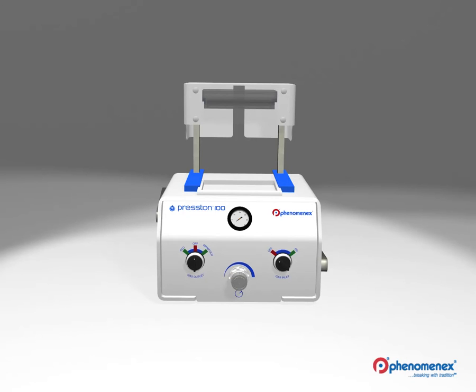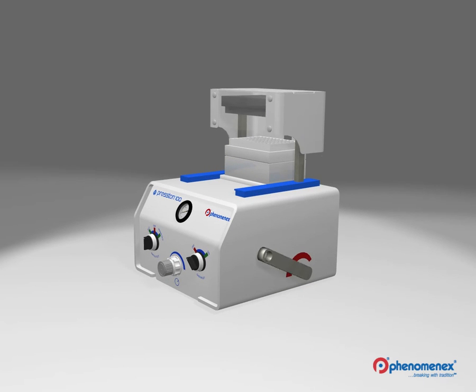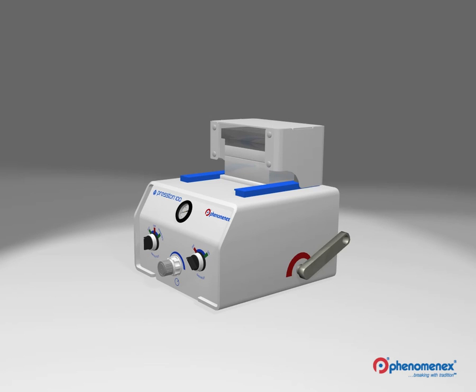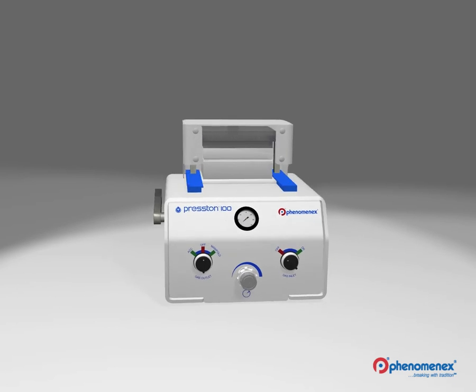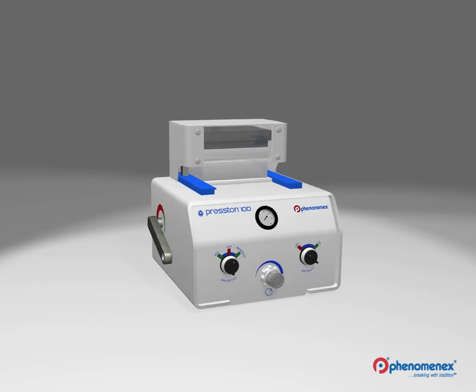To process samples using the Preston 100 Positive Pressure Manifold, simply load your collection plate or waste container into the sliding locator plate and then place your preloaded sample on top. The locator plate is then slid into position and is ready to be processed. Using the manifold positioning lever, the manifold can be positioned on top of your samples. The manifold is then locked into place using the manifold locking lever, forming a seal between the manifold and the top of your 96-well plate or tubes. Your sample is now ready for processing.